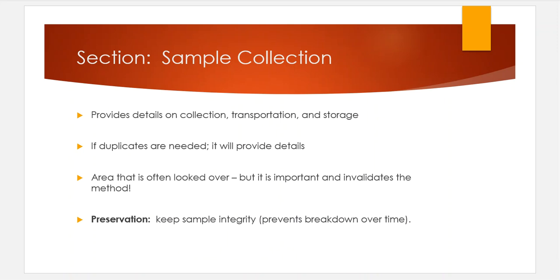Next up, we saw sample collection. Again, it's all about how do they go and collect them? How do they transport them? The idea of duplication, the idea of keeping it cold, keeping it frozen, putting some acid in it, preserving it. All of those details, every bit of them are going to be included in the sample collection section.